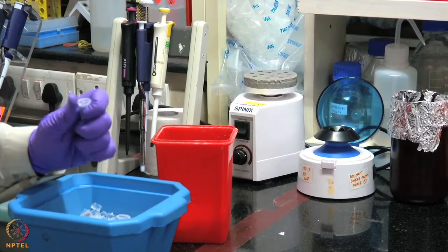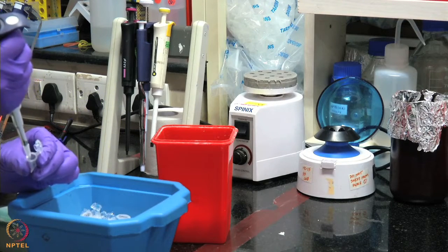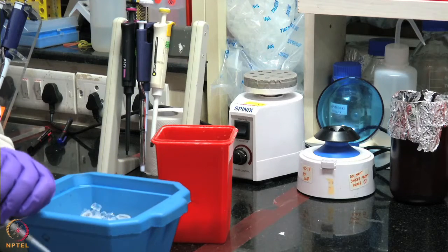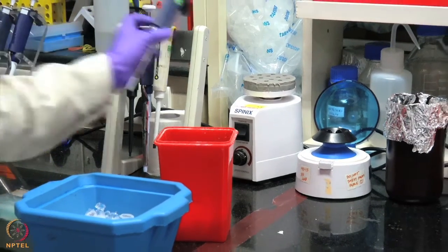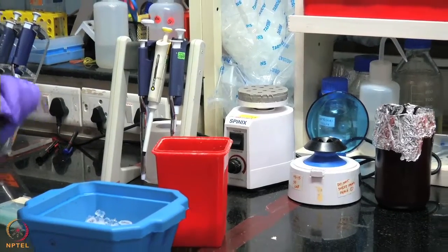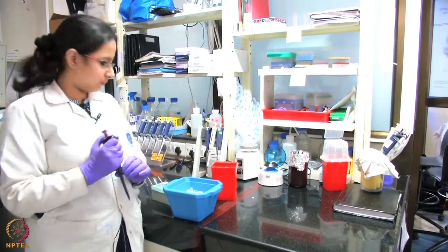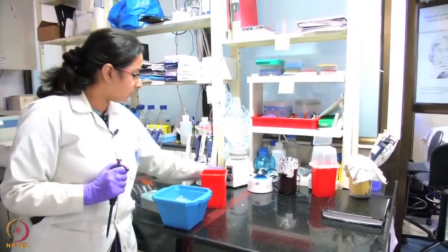I will add this to the ligation mix. Now the last thing to be added is the ligase enzyme. Again we are using a small pipette because we require very little quantity of the enzyme. I'll give the enzyme a short vortex as well.